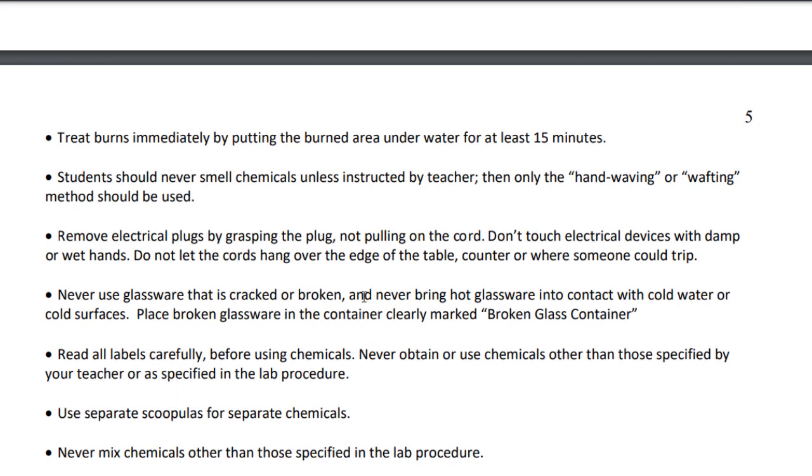Glassware, again, we'll go over this when you guys get in here. Just don't use anything that's broken or chipped. Let me know if you find that it is or that you break it yourself. We'll clean it up and we'll put it in the broken glass container. It's total garbage because it'll shatter if we put anything hot in it, so it's useless to us. We're not going to use that beaker or that test tube if it's slightly damaged, okay?